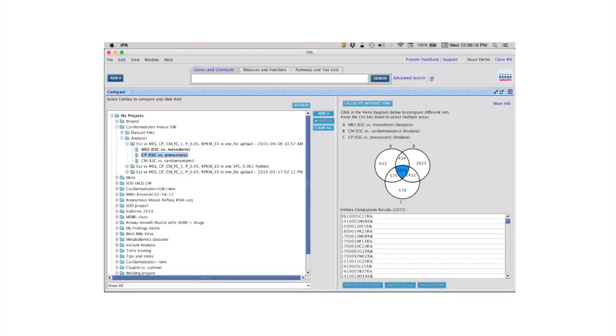If I have another analysis of a different tumor type to normal, that could be a second analysis, which also has fold changes. Now I can do a comparison analysis of those 2 analyses, asking how analysis 1 compares to analysis 2. I'm basically asking what effects the tumor has in tumor versus normal, versus this other tumor versus normal. It's really just lining them up side by side.